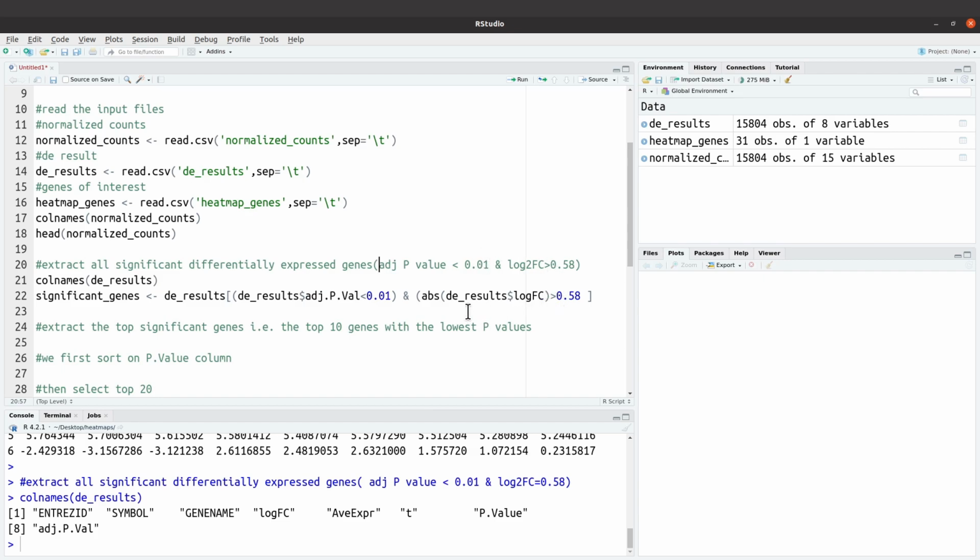Let's just check and make sure that the instructions here are all okay. So we have this one here, let's just add it. Okay, now they're okay. So make sure you type the same thing as I've done here, and also make sure you bring the parentheses where they are supposed to be.